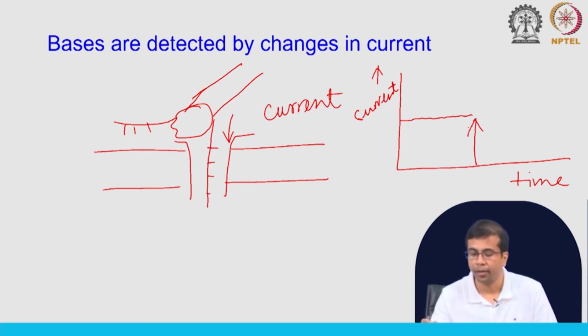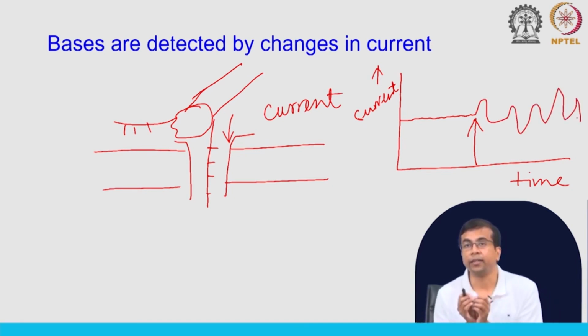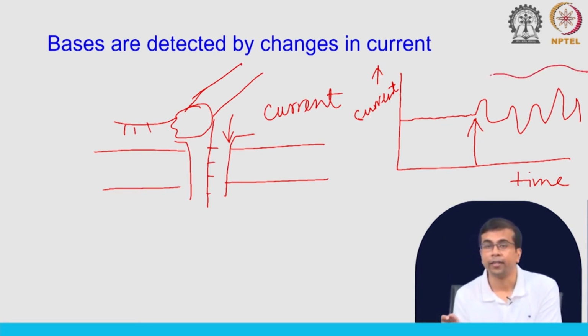What will happen is that because of these specific sequences, they will modulate or change the current, and we will start seeing this kind of peaks, valleys, some sort of change. Again, this change is dependent on the sequence. So, by looking at the change in current here, what kind of change we are seeing, we can then identify what the bases are that are passing through the nanopore.